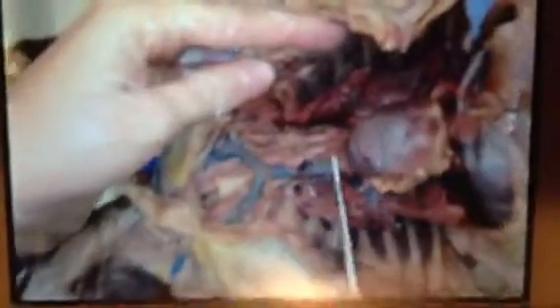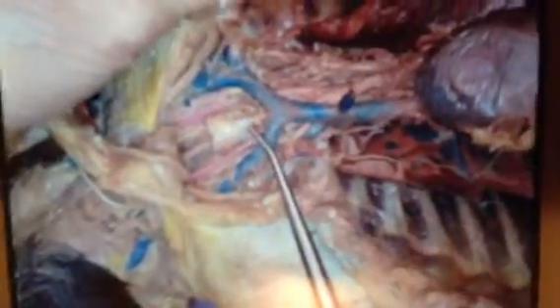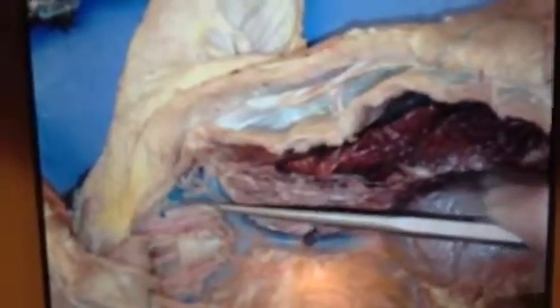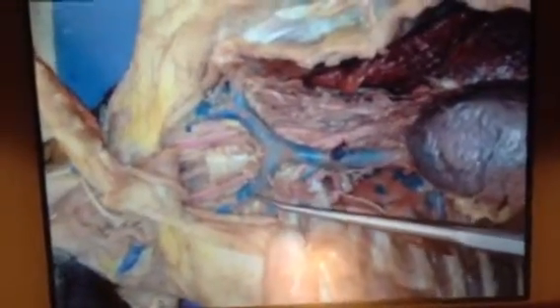Okay. Now with the blood vessels. Starting from the top again. Superior vena cava. Left and right brachiocephalic veins. Now branching out to the upper limb, we have, it's going to be left subclavian, and then left internal jugular, and the same on the right side. With the right subclavian and right internal jugular vein.